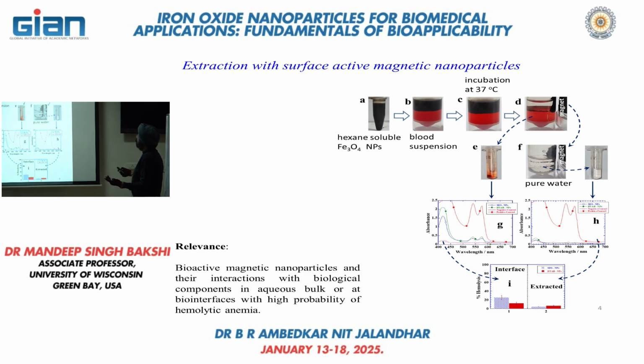Now, after incubating it at 37 degrees centigrade for a few hours, you see the magnet over here. We place the magnet and trap and extract all the magnetic nanoparticles. So those magnetic nanoparticles we extracted, we see that there is one possibility.